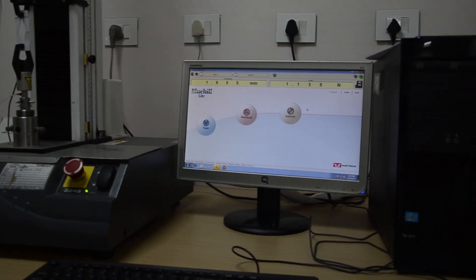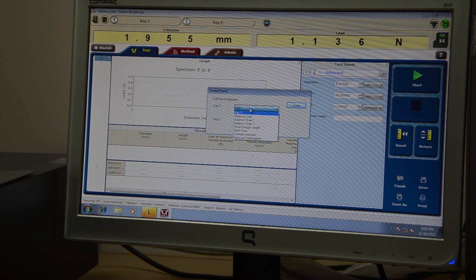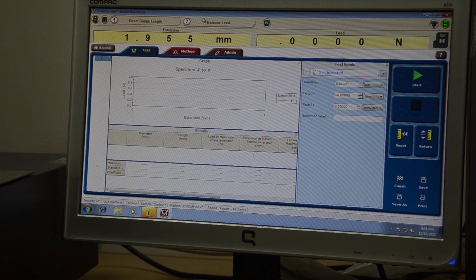This is a 5 Newton load cell so we cannot put any extra load on it. Key 1 will reset the gauge length and key 2 will balance the load. We made it zero — it has reset to the present situation as zero. We set the rate to 5 mm per minute and name the specimen S1.